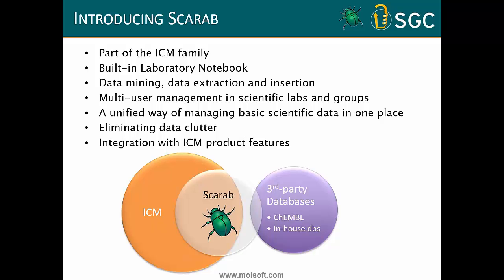Multi-user management in scientific labs and groups is a key aspect of it, and we believe it's a unified way of managing all our basic scientific data in one place and eliminating the data clutter, and also integrating with some of the key ICM product features, which hopefully I'll be able to show you. But as you can see from the diagram at the bottom, we have ICM, and Scarab is part of the ICM world, but it can interconnect or interrogate third-party databases such as ChEMBL or in-house databases, and I'll show you some examples of those as we go along.